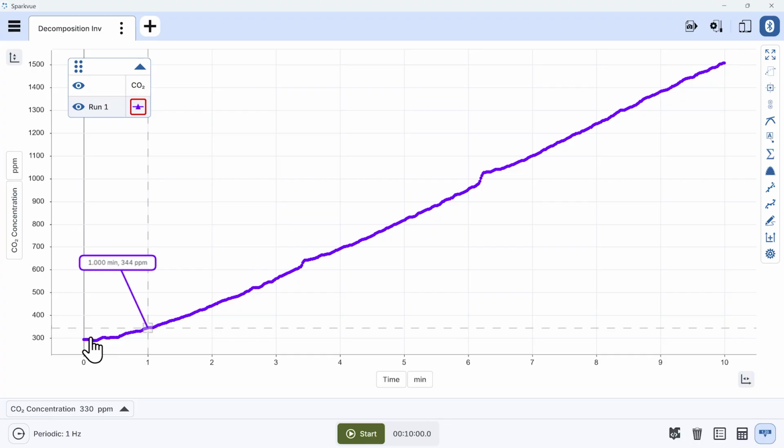All the data recorded between start and stop comprise a run of data, which the graph legend shows to be named Run 1. Although this experiment has each student group record only 1 run, other activities will involve multiple runs of data recording.